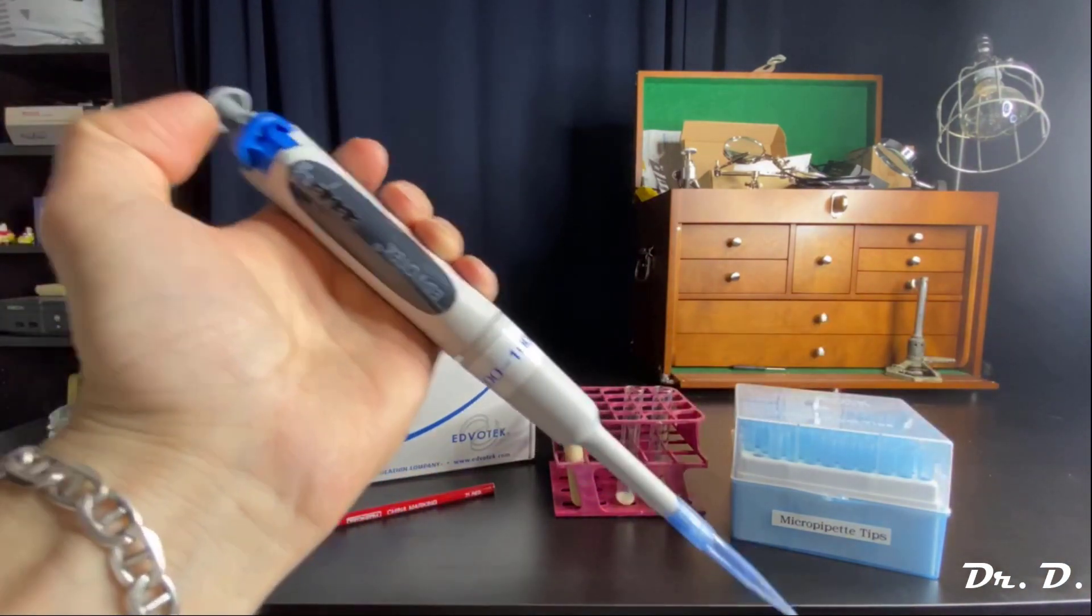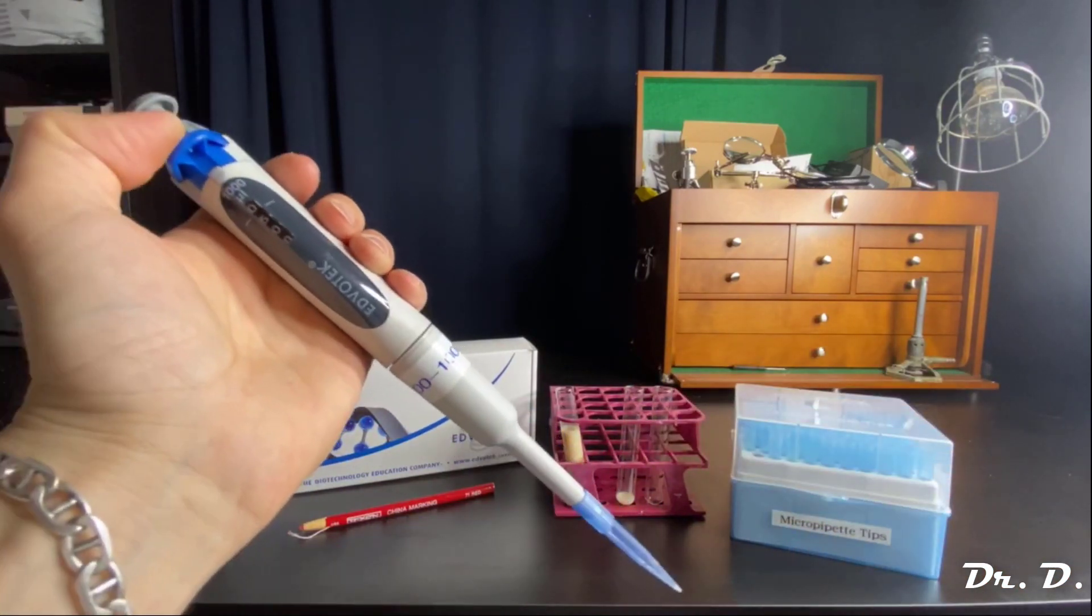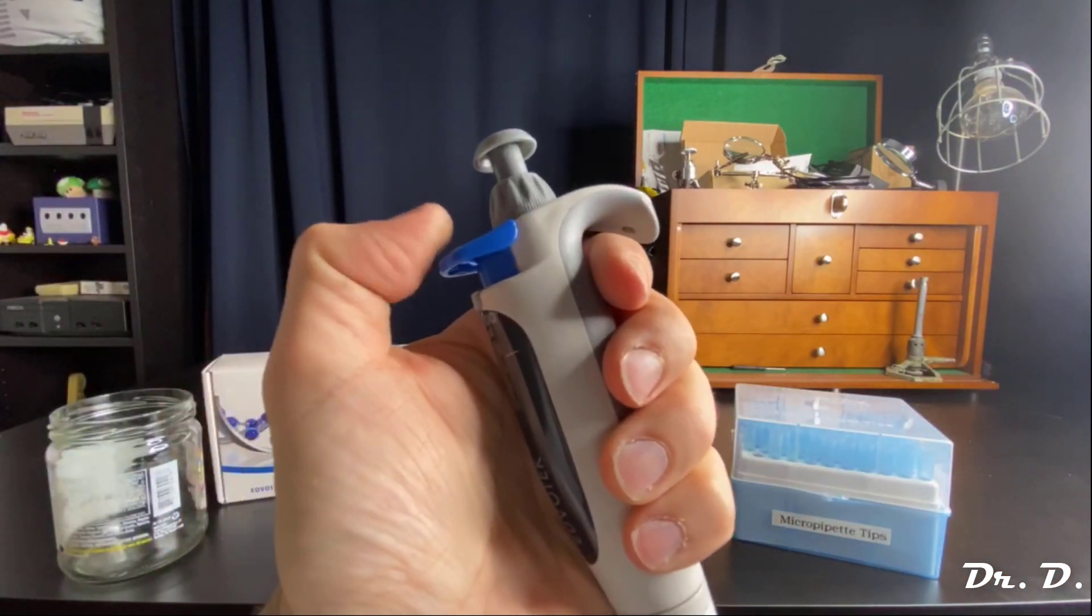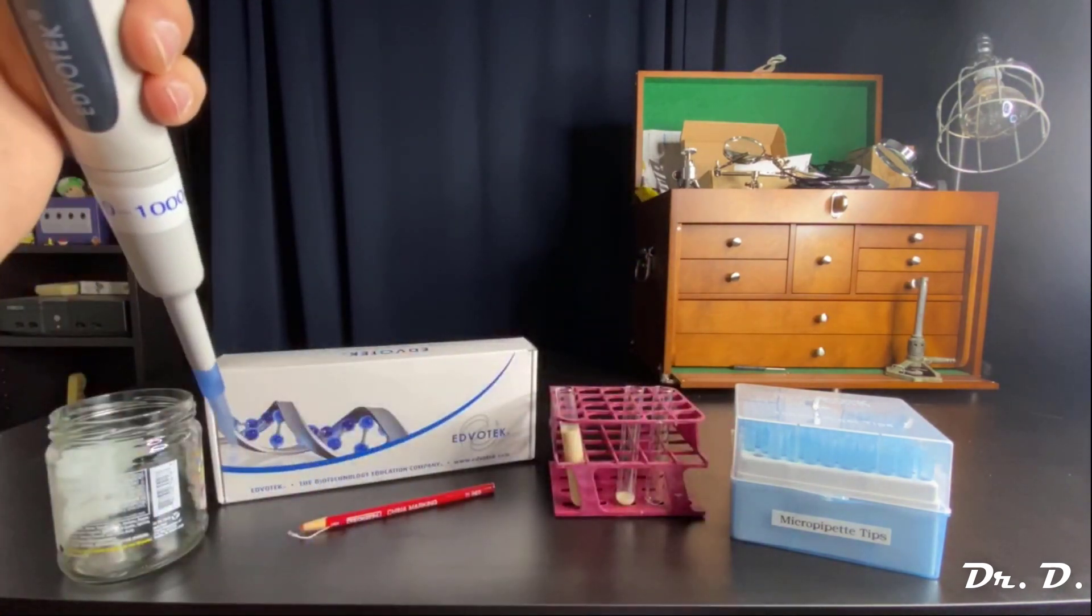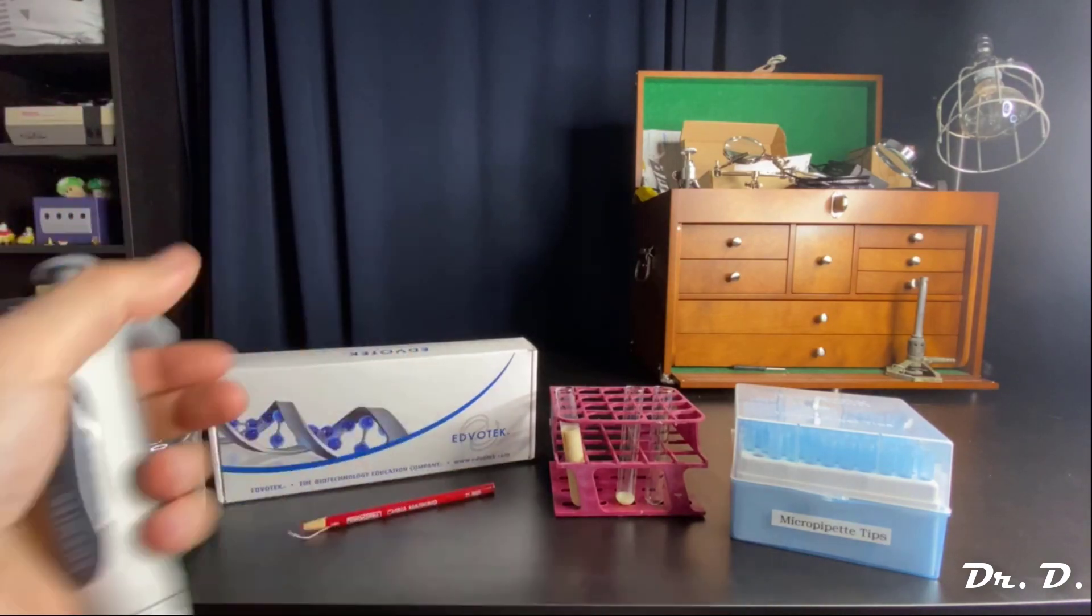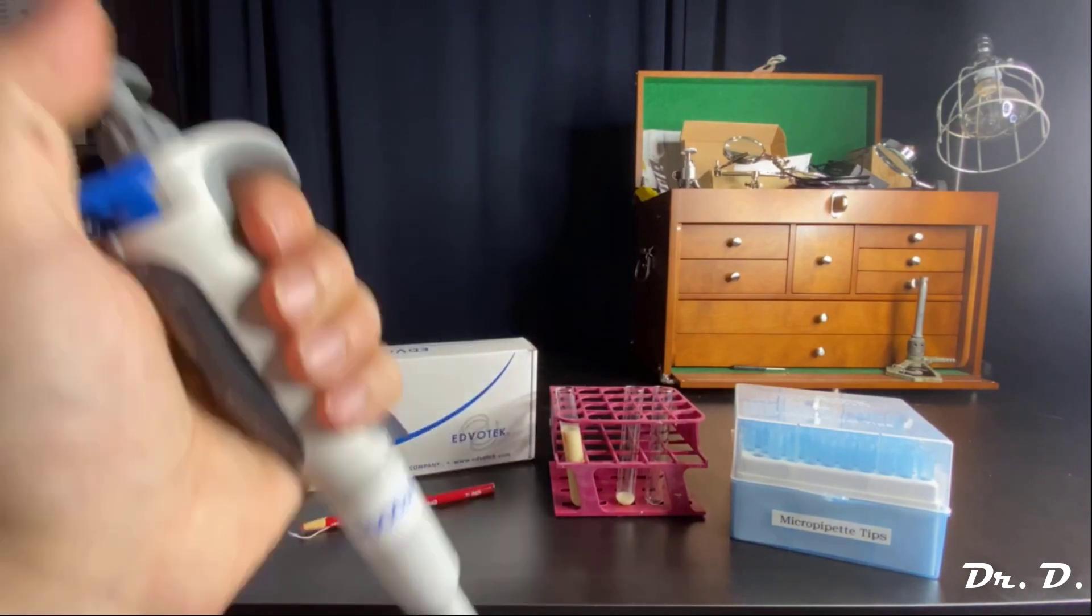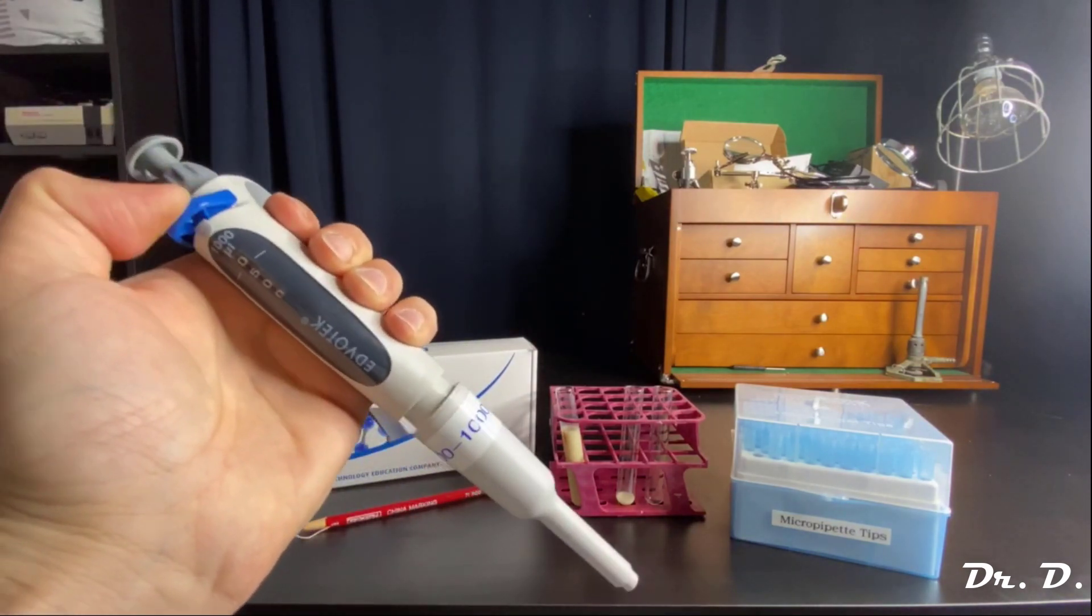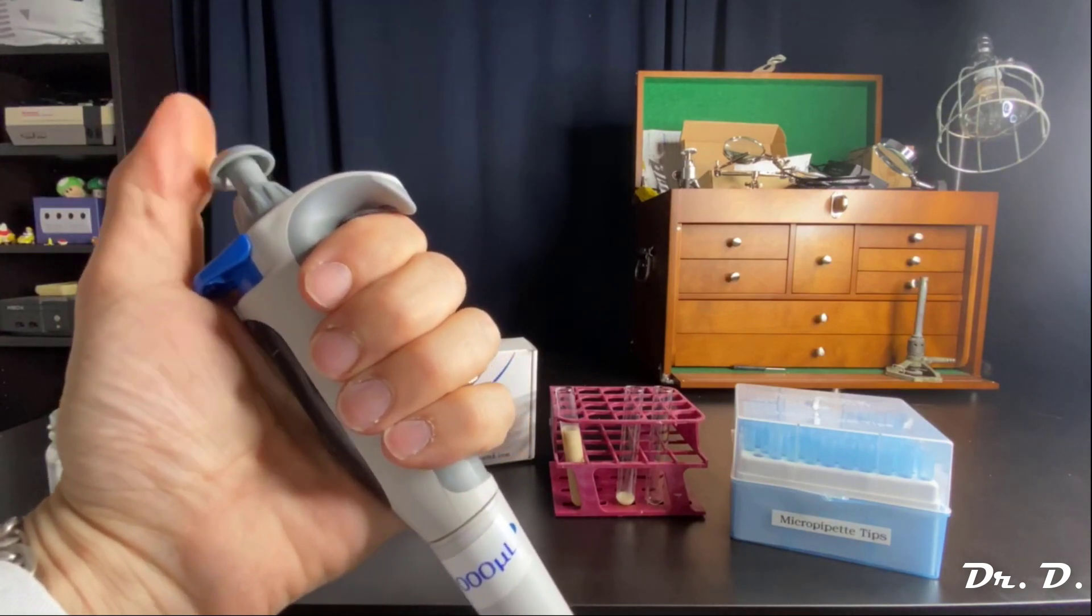Now, once I've used the tip, I no longer want to use that tip. So I'm going to use the ejector button. This blue button is called the ejector. And I'm going to use the ejector button to eject my tip into a receptacle. I'm just using this glass bowl here. But you will have your own trash receptacle. And the blue button is for ejecting tips.